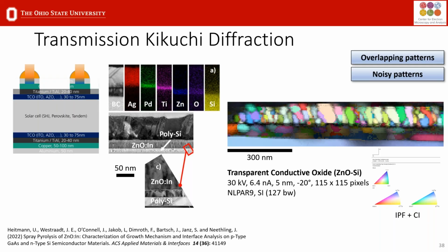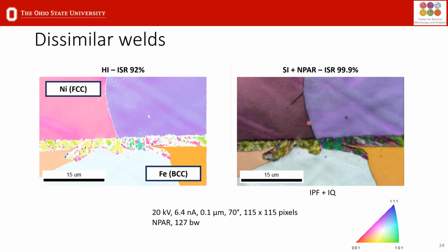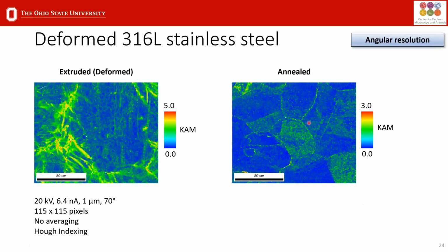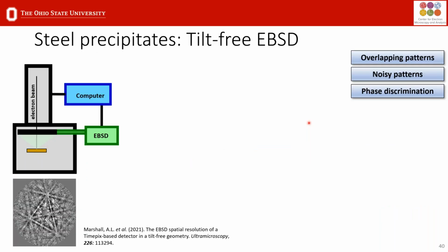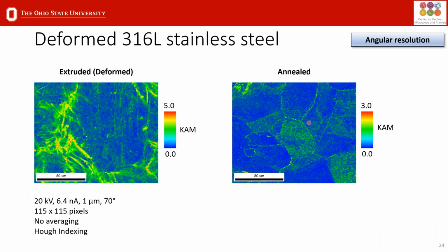Do you have any experience of using this spherical indexing with materials that have pseudosymmetry? So no, but very interesting. Will Lenthe has a paper out from Carnegie Mellon where they analyzed pseudosymmetry. Sorry, let me just get to that slide.